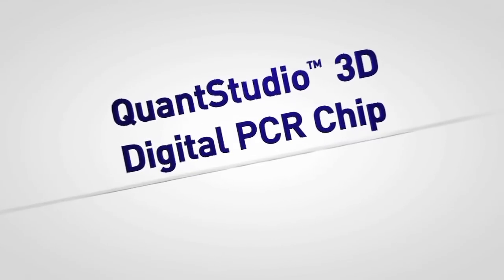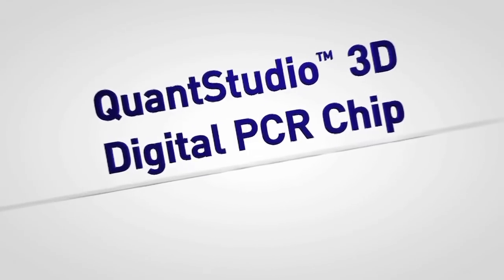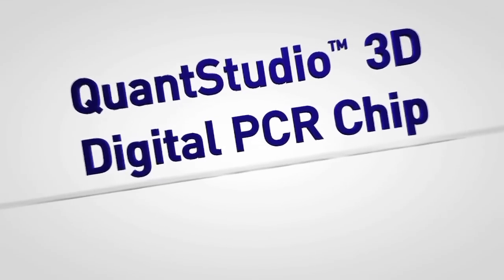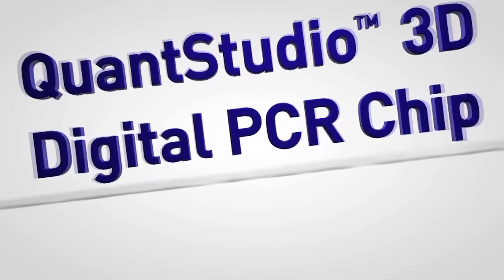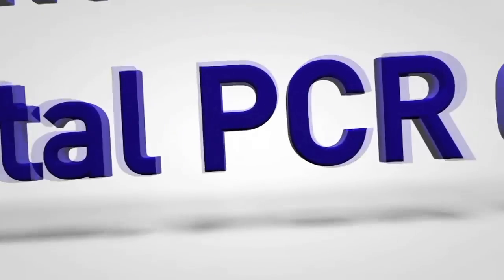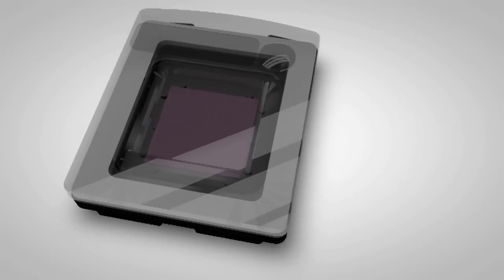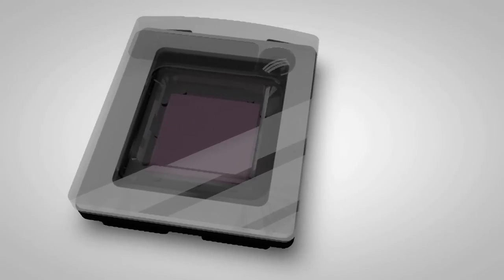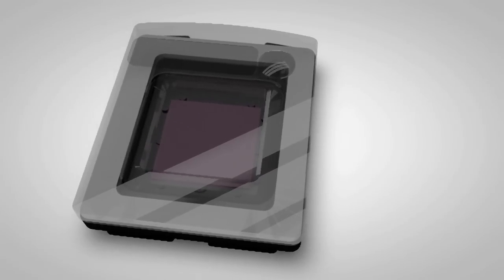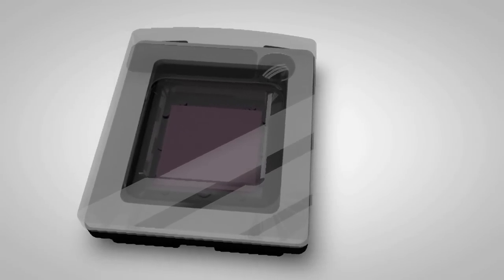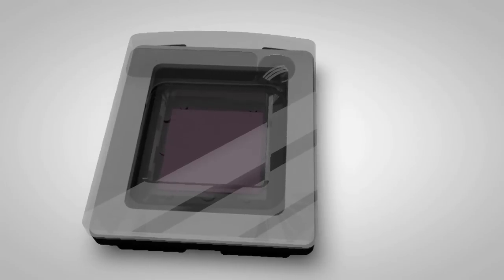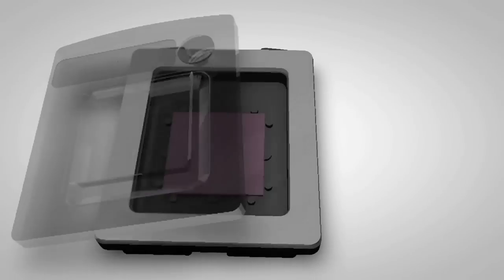Through the use of a simple chip-based consumable that can be rapidly loaded with little to no dead volume, the QuantStudio 3D Digital PCR system is a new and highly affordable way to do digital PCR.